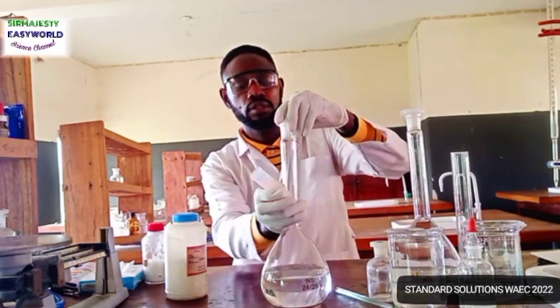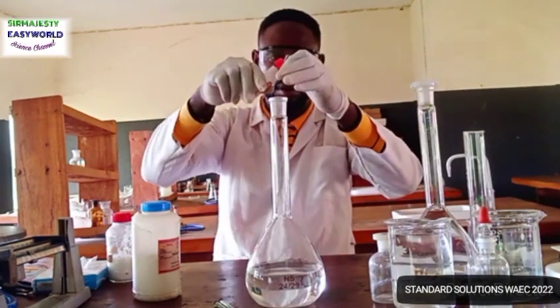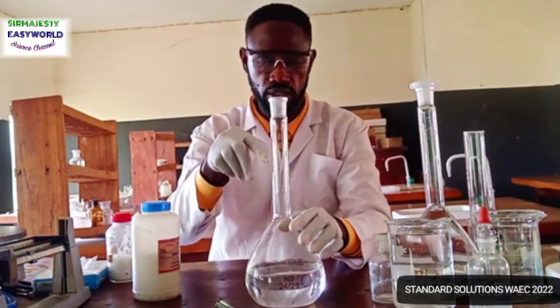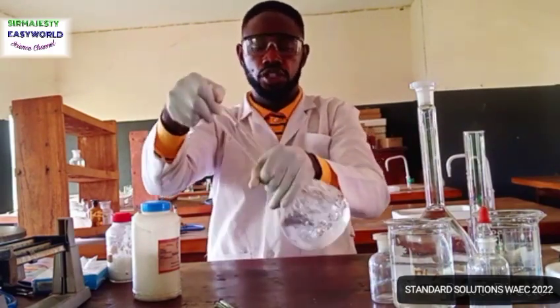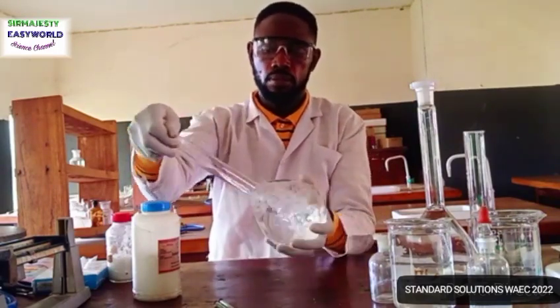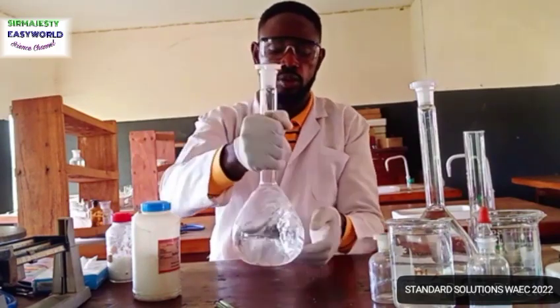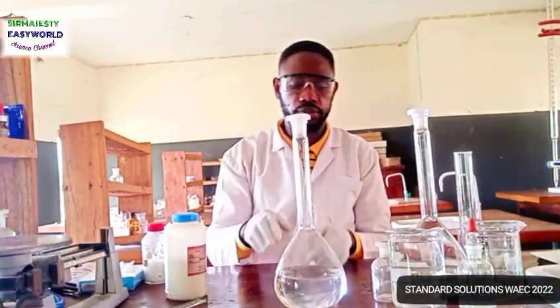There is not much to it. Just open this. Okay. You carefully add them. If you can, try your best to avoid anyone staying on the wall like this one. But what I'll do is I'll gently swirl this water to dissolve the whole. You shake well. Gently take it this way. Don't allow the liquid to pour at all, because we already added some potassium iodide. You'll be losing some of it. So potassium iodide is extremely soluble in water. All of it is dissolved.